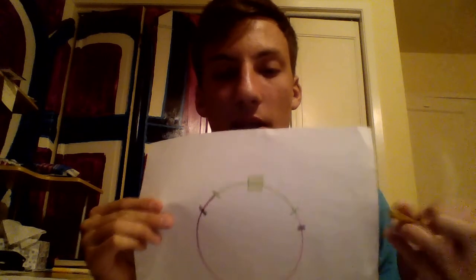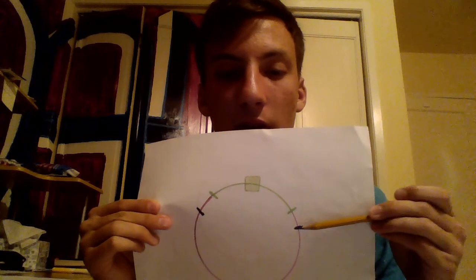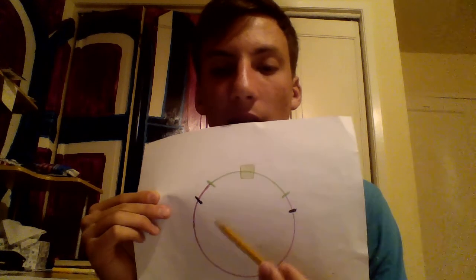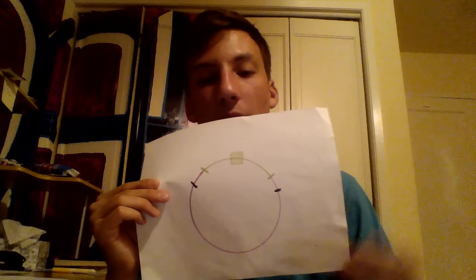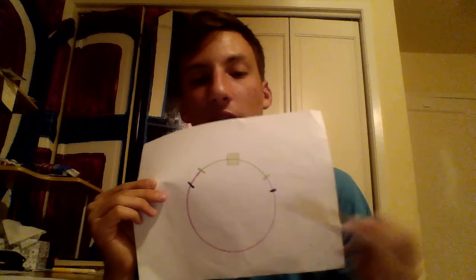If you look back here, we see that our primers latch on at this black line and at this black line. So it attaches onto the vector backbone, and what's really cool is it's actually going to cut right here.